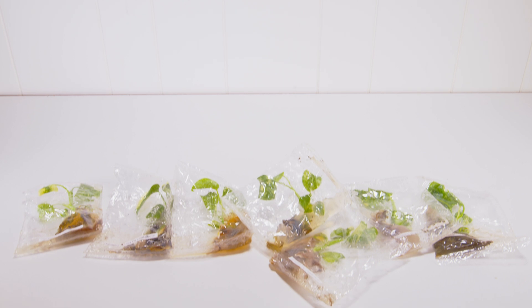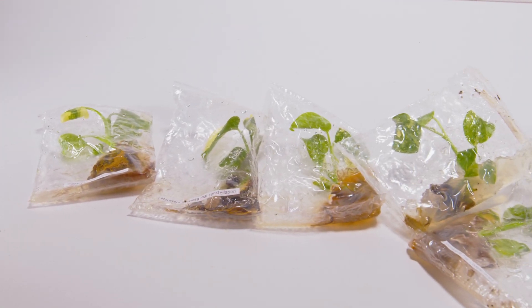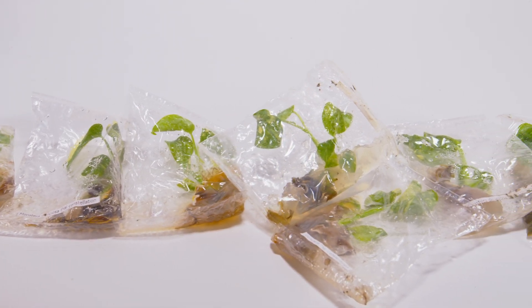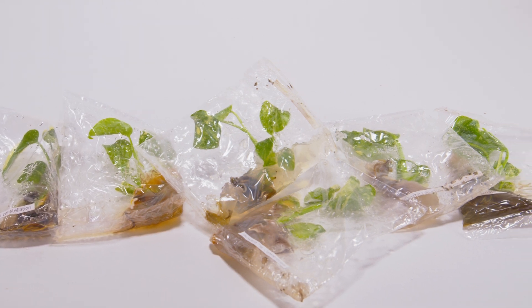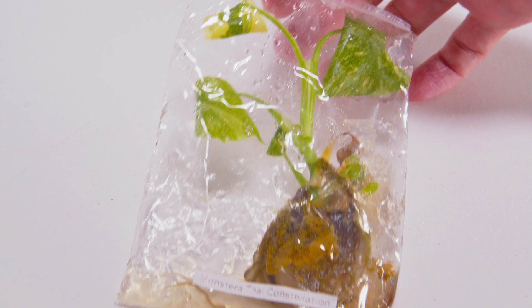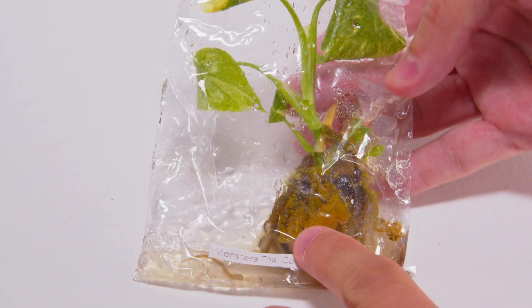I did leave these in the flask for an entire month pretty much out of laziness and busyness — I do not suggest this. A lot of mold started to grow inside the flask. Albeit a lot of them were kind of a nothing burger, you don't want to take the time and chance it. The website does have instructions on how to do this with hydrogen peroxide and stuff.